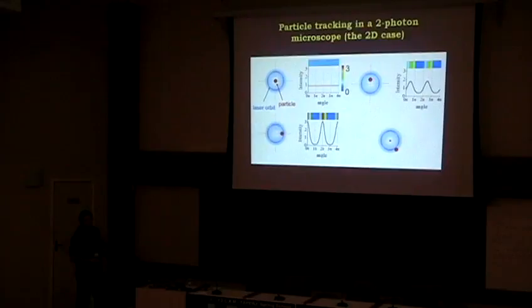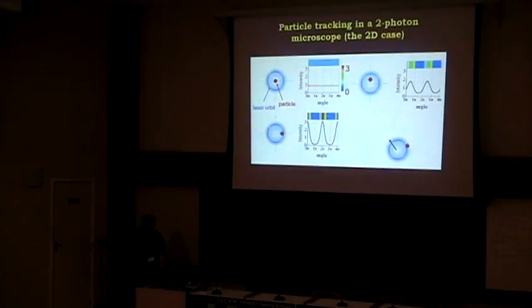So imagine we have a particle there, we measure this modulation, so we recenter the orbit at the point we measure the highest signal, like this. Then we start all over again and recenter the orbit each time we calculate a new point. We can actually track the particle and see exactly where it's going.